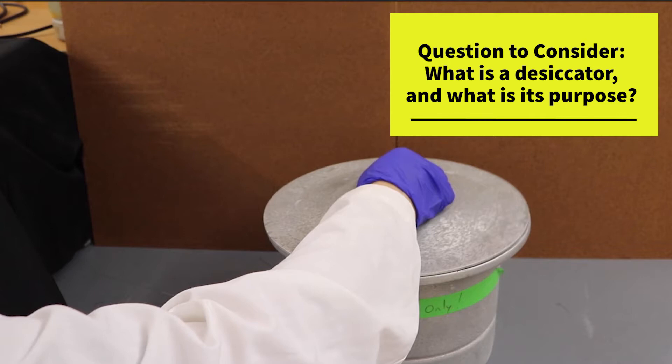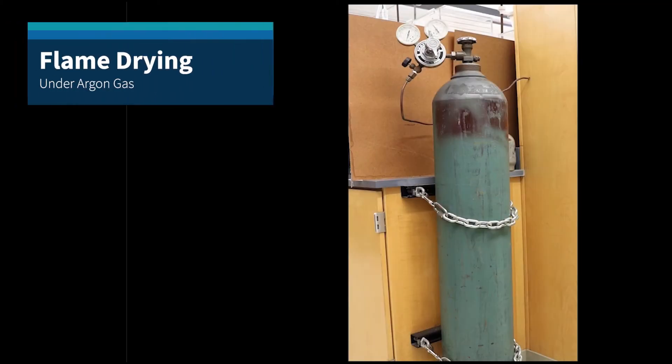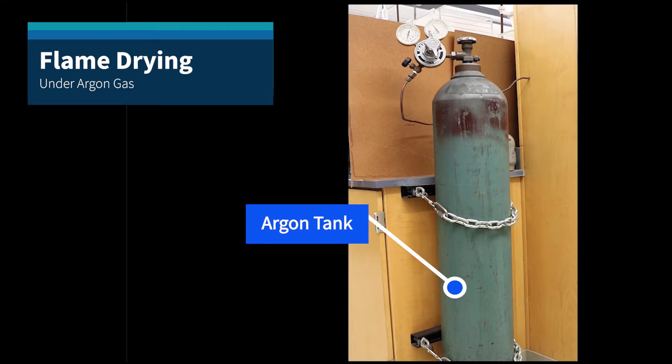If there is not enough room, there is no need to place the round bottom flask into the desiccator. It can be directly flame dried. The next step is flame drying under argon gas. This is the argon tank.